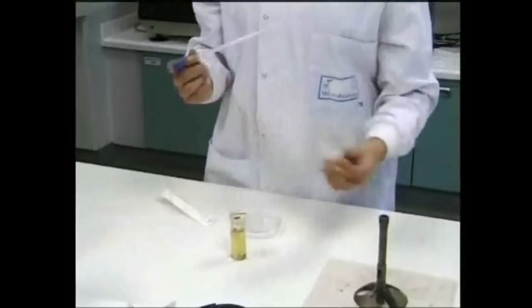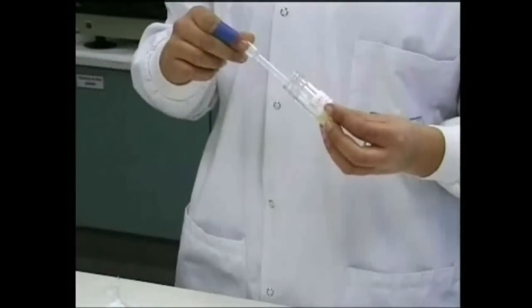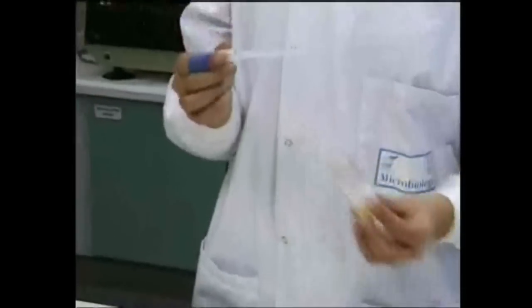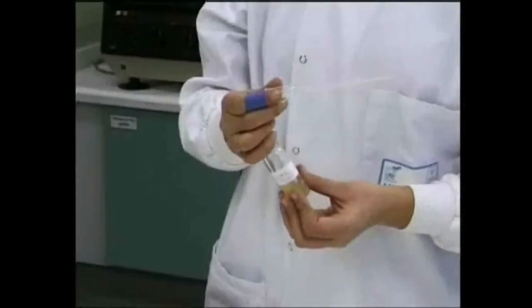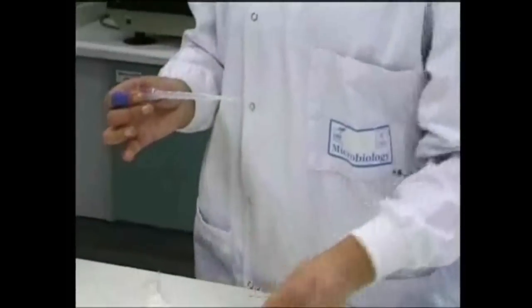The culture bottle is opened and flamed, and between 0.1 and 1 cubic centimeter is removed using a pipette. Notice how the cap is held in the little finger of the pipette hand. The culture bottle is then reflamed, and the top is replaced.